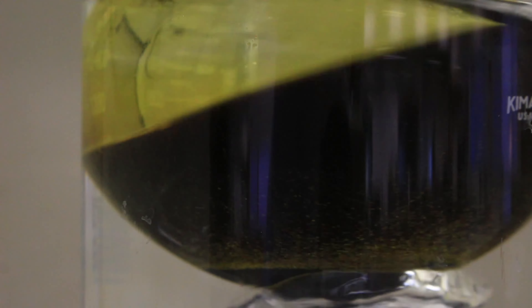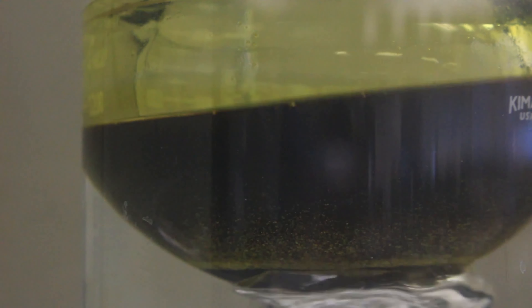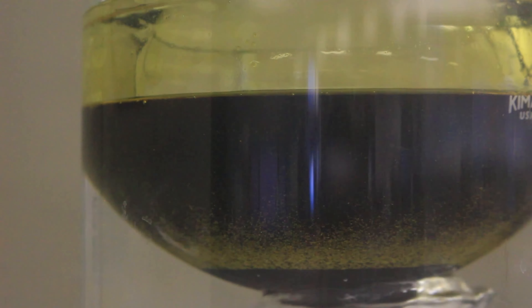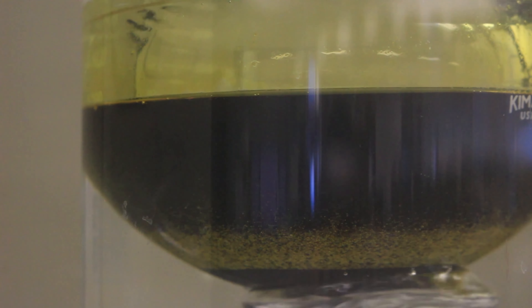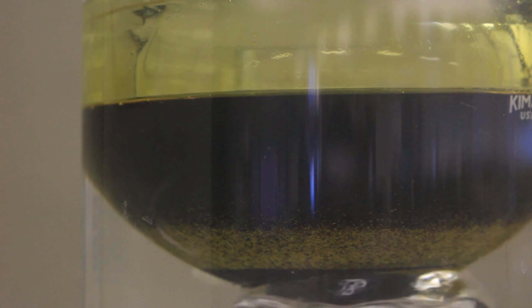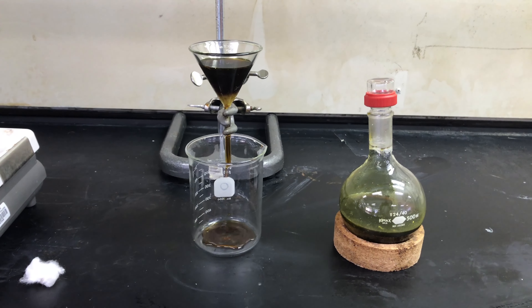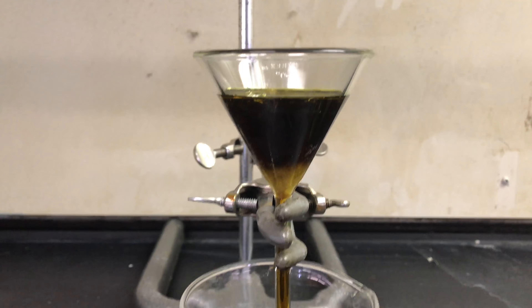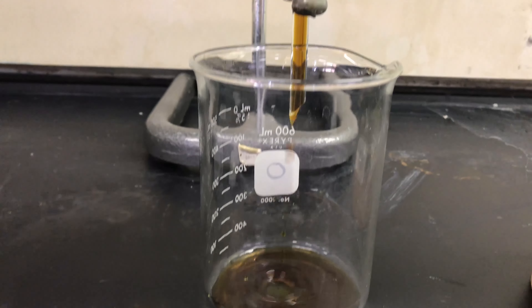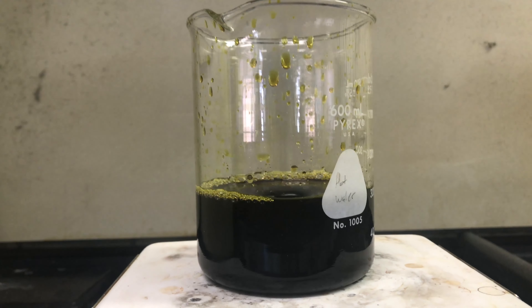I thought that this precipitate was some sort of indicator that the reaction was moving forward. But it turned out after the fact that the precipitate was maybe sand or something like that — it didn't react with any acids or bases. It makes sense that sand would be in there because the manganese oxide is for ceramics. Having some silica isn't really going to mess up making a ceramics glaze the way it gets in the way of a chemical reaction.